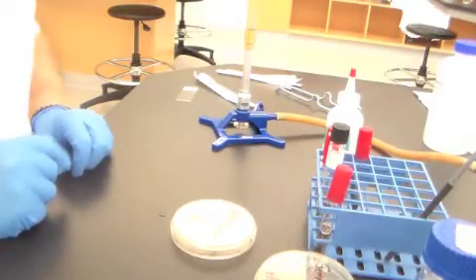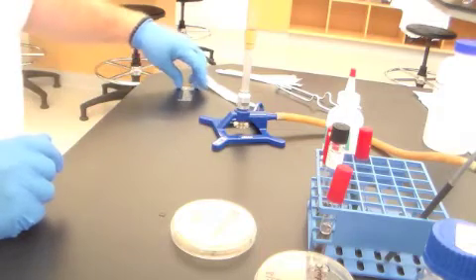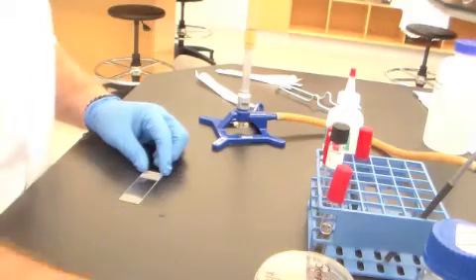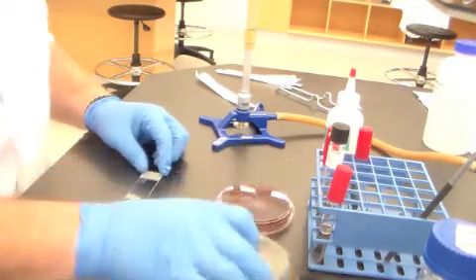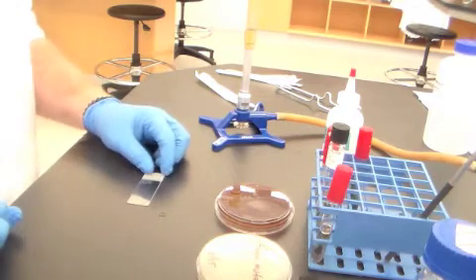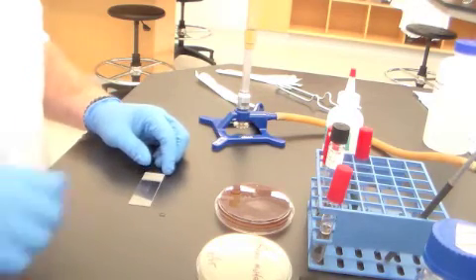The only test that you're going to do this week in lab where you'll actually see the results is a test called the catalase test. The catalase test assays for an enzyme, appropriately enough named catalase. It's a very simple, pretty elegant, actually even kind of a fun test to do.